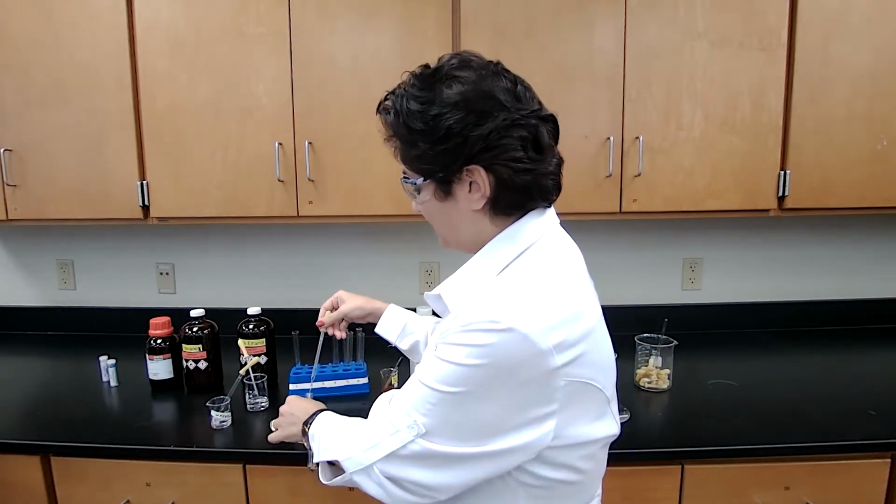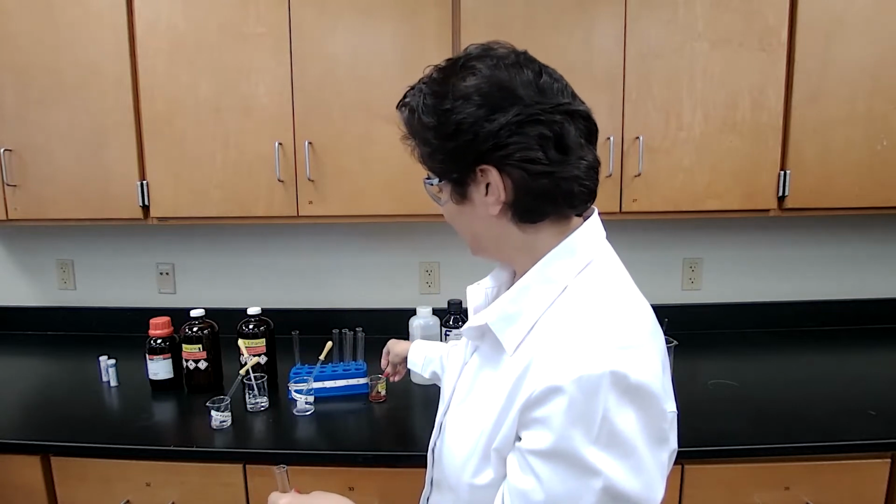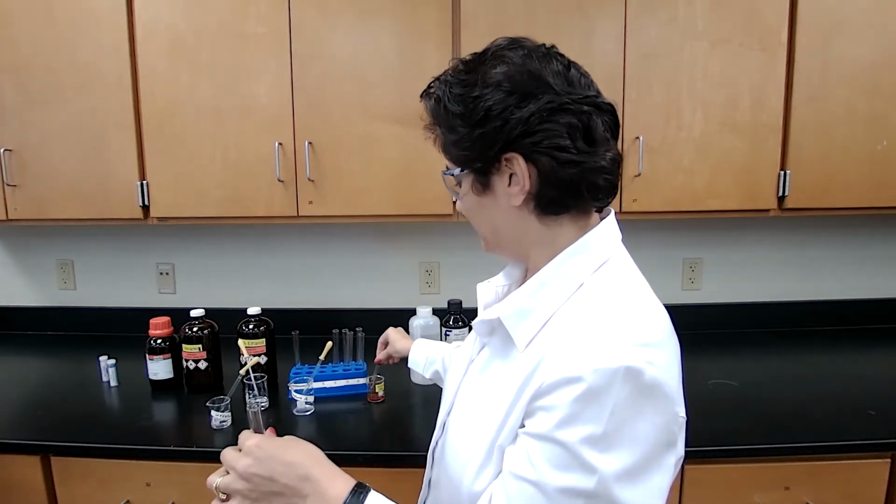When you come to the lab, please work in the fume hood with these compounds. Organic compounds are volatile. They can give off so much vapor that you don't want to inhale. So you want to work in the fume hood.